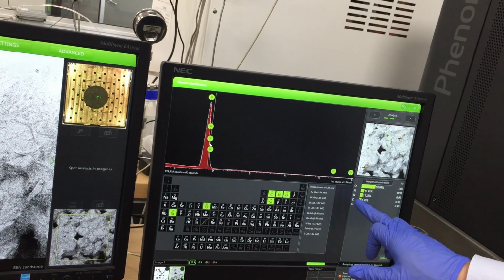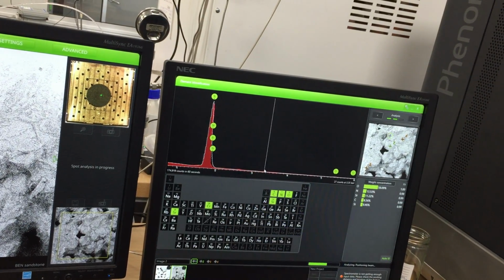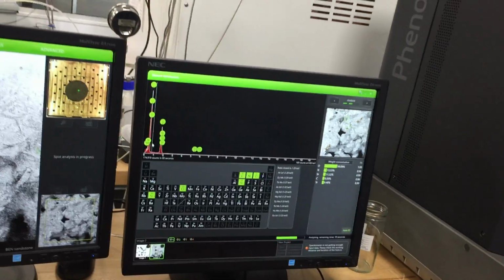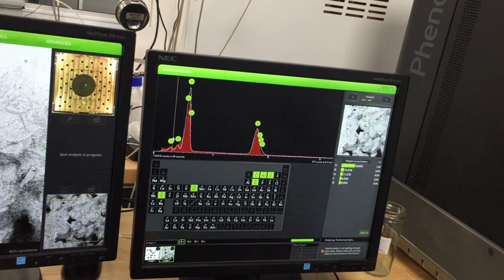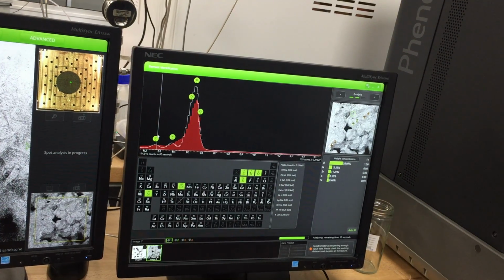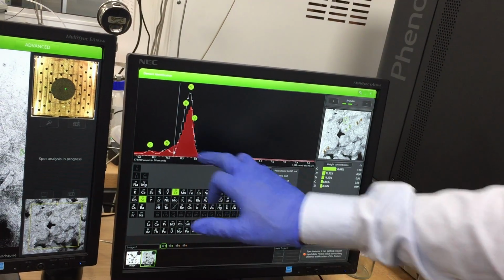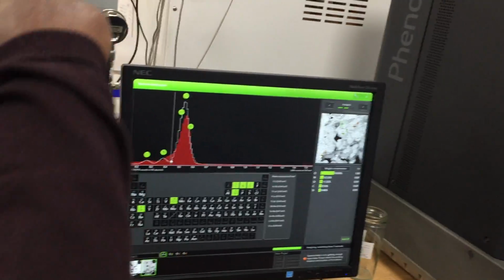For example, carbon has 0.98. If you want to unzoom it, bring your cursor to this and pull the wheel backwards, and it will unzoom. And then carbon is somewhere there. You can scroll forward and click and drag. You can see why carbon is not 0.99 or 1, because you can see there's a little of that and that, but the red area doesn't really conform to that.